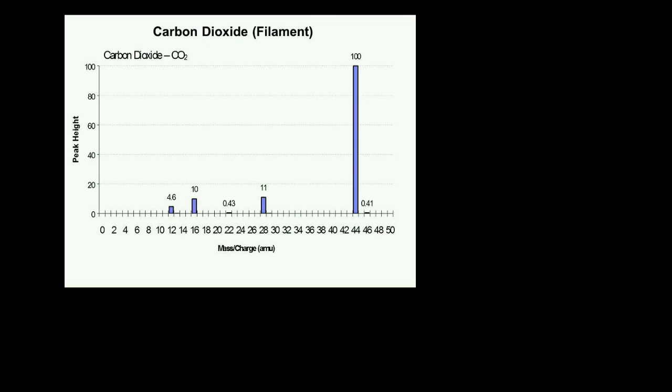Once you turn on the filament and heat it up, there is typically carbon in it, whether it's a thoriated filament or a tungsten filament. There is also water in the system, or in the case of an yttria filament, an oxide, and the carbon reacts with the oxygen, with the water, and produces both carbon dioxide and carbon monoxide.